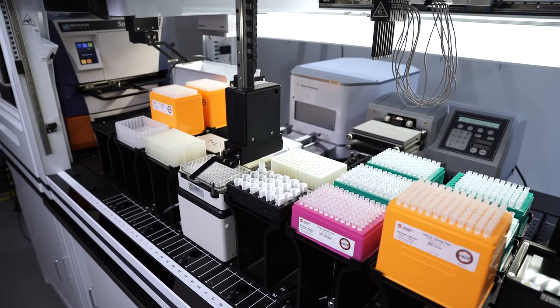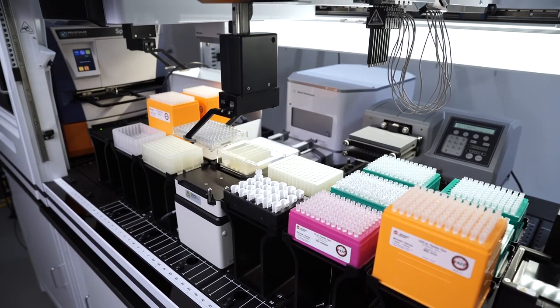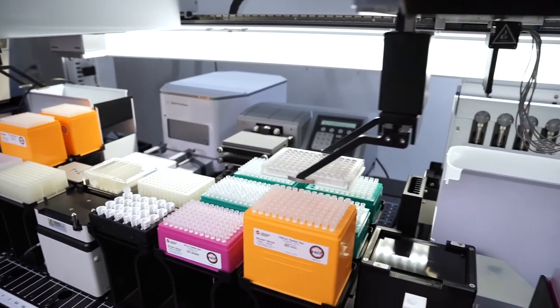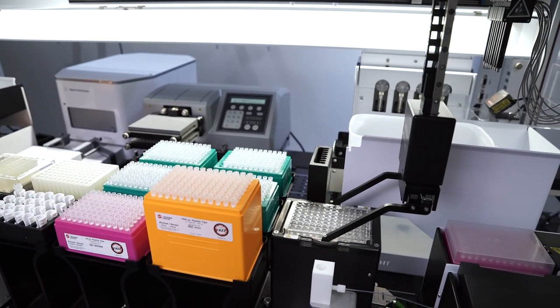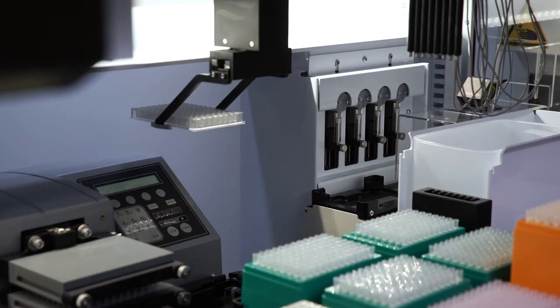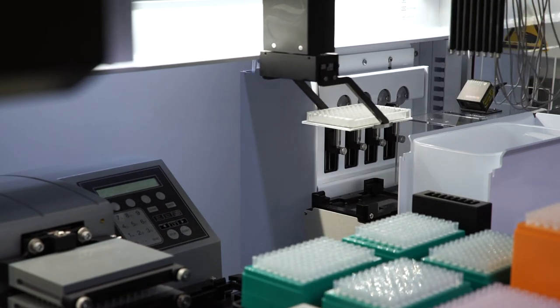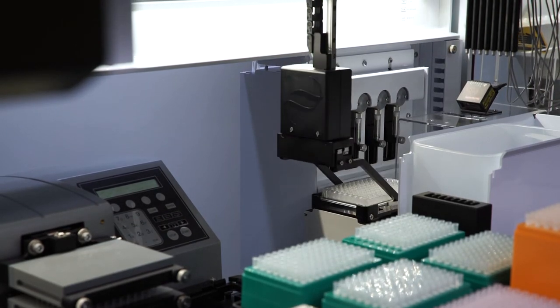Temperature control is crucial for a successful ELISA reaction. Peltier on the Biomech provides a convenient option for incubation. In addition, superior environmental control for high-throughput applications can be achieved with an integrated incubator.